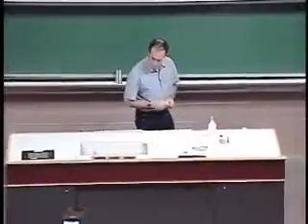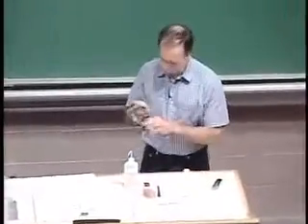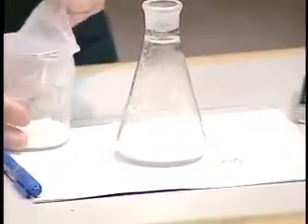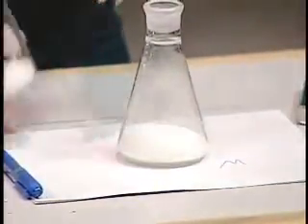I brought some barium hydroxide octahydrate and some ammonium nitrate, and I'm going to combine them. So that must be the barium, doesn't smell. Ammonium compounds smell. They're both solids, okay? They're both white solids, powdery. There's the ammonium nitrate and there's the barium hydroxide.